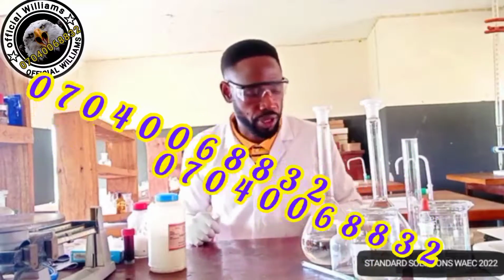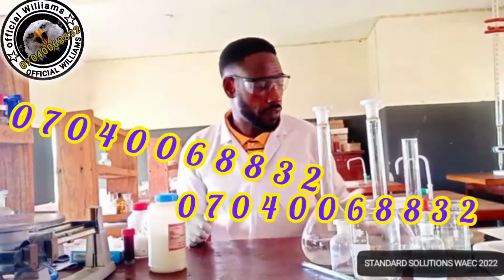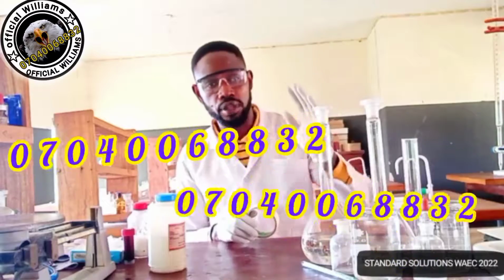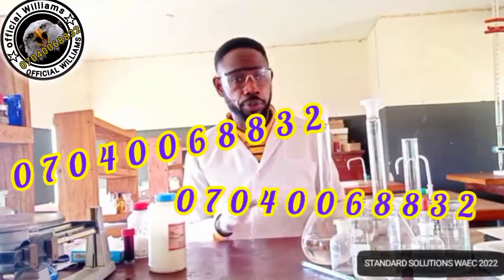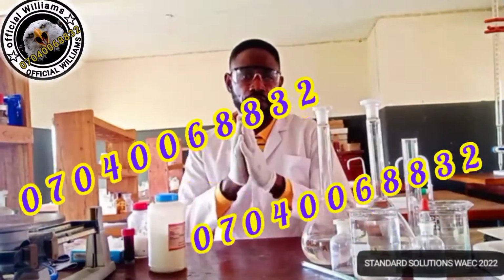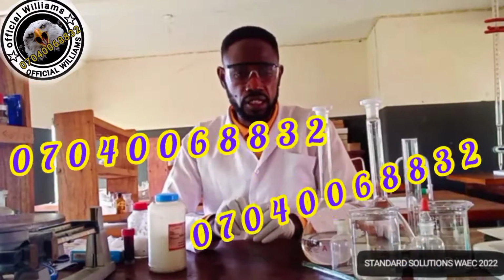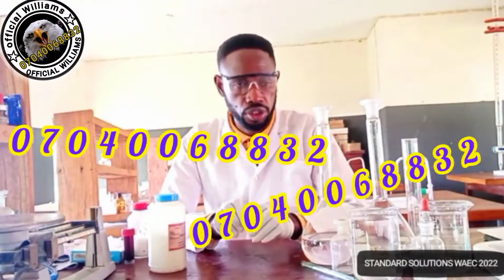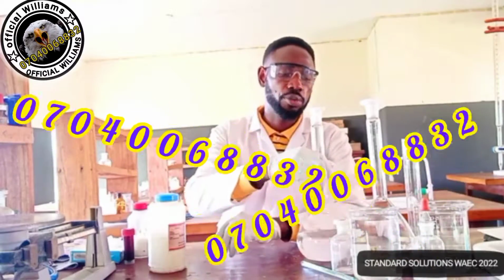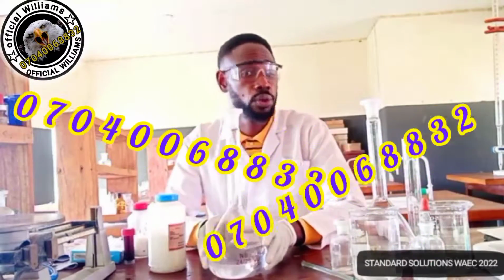So back to the preparation of the two standard solutions A and B. Lest I forget, you also need a masking tape or a label to distinguish between A and B to avoid confusing them, or you prepare them separately. Now, the step involved for A is to dissolve the iodine in potassium iodide solution. Then first of all, what must you do? Remember, they say it's going to be contained in 1000 cm3, that's 1000 ml per solution.